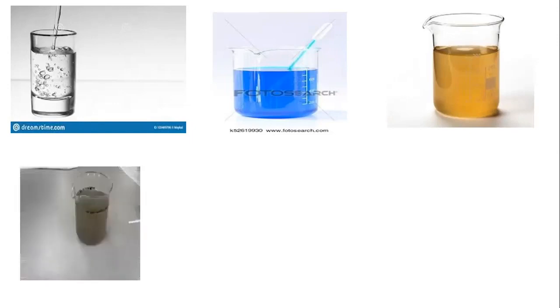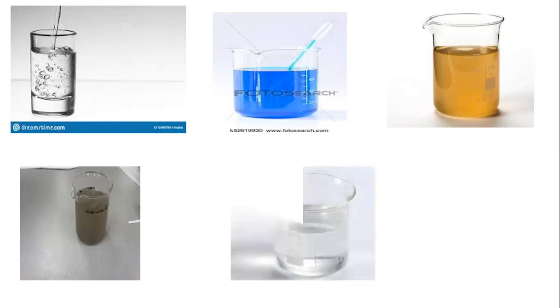If you see the fourth picture, I collected the drainage water. The drainage water is a dark black color, and it contains many various chemicals such as organic, inorganic, and also biological. That is nothing but drainage water. Suppose you take a sample from the drainage, we can come to know how much chemical is present.